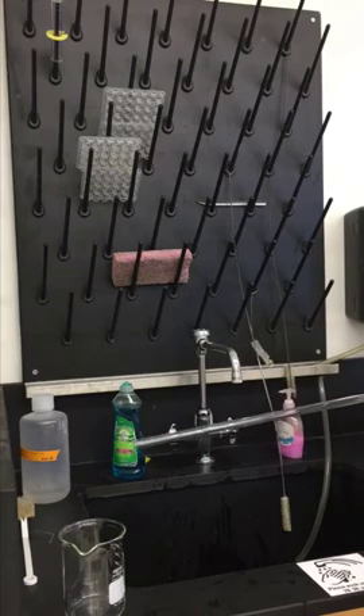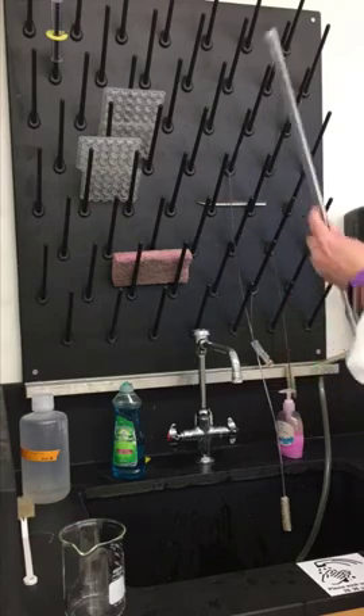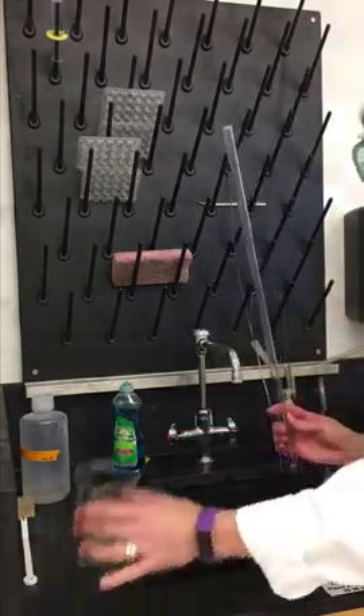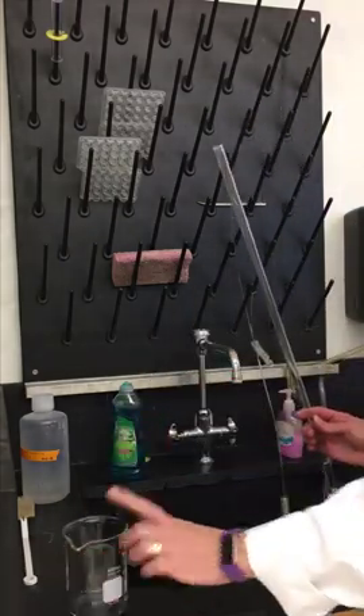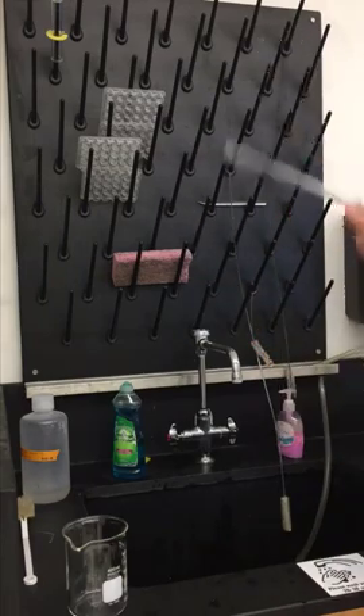The water is flowing down the walls of the glass. I'm doing this over the sink so if anything spills it goes into the sink. If I'm not near a sink, I would use a waste beaker and hold the open end of the burette over it, then let it flow through the tip and rinse.